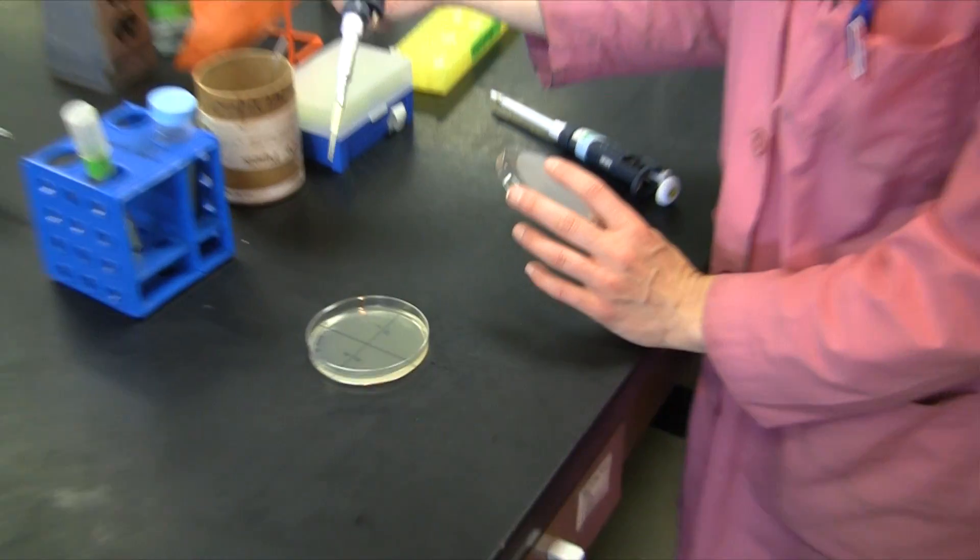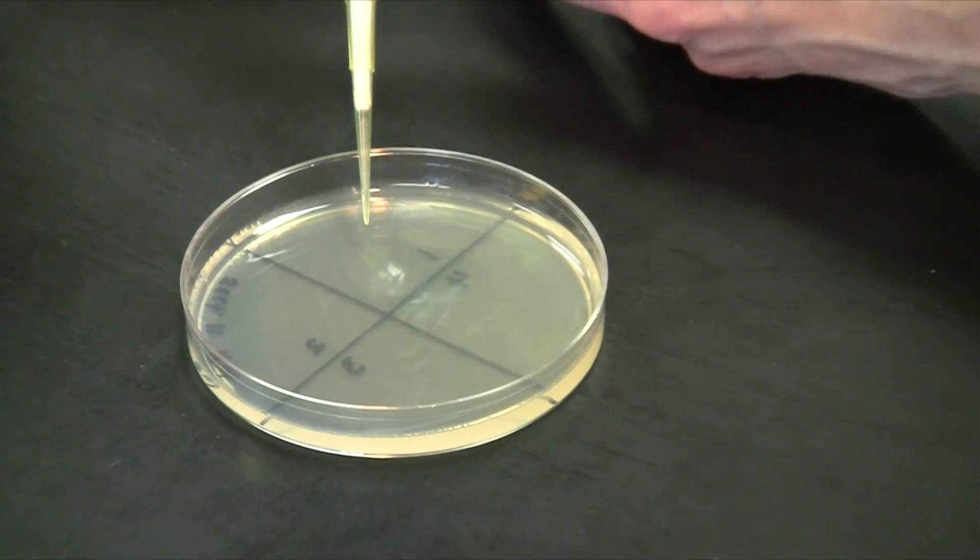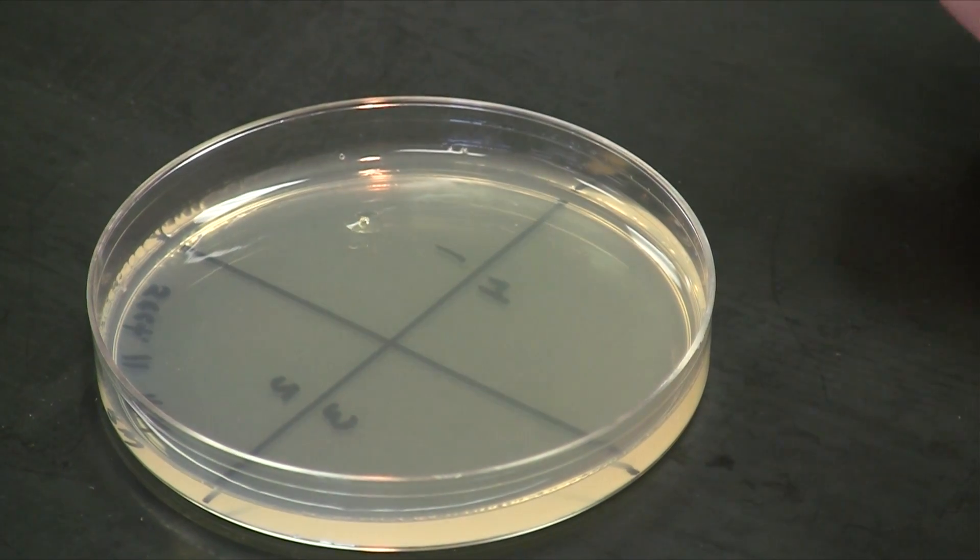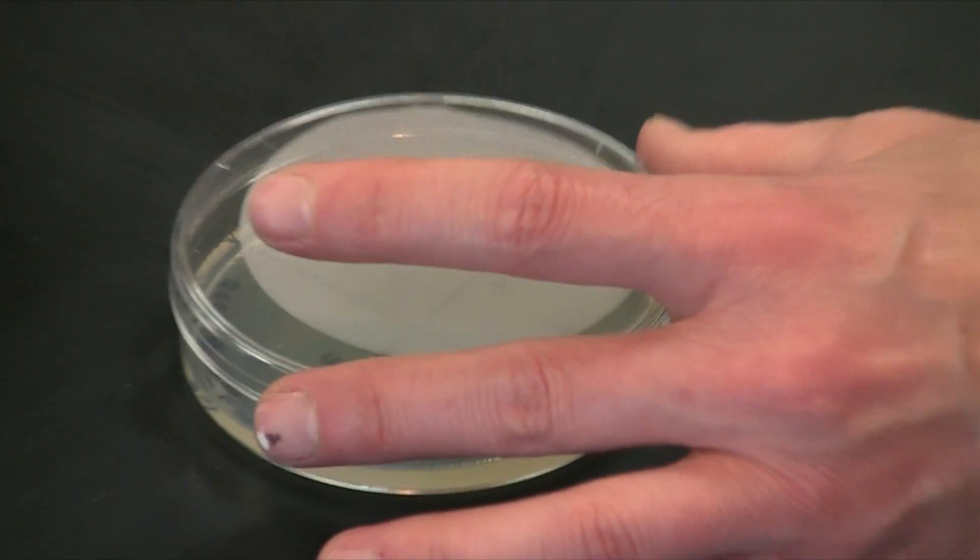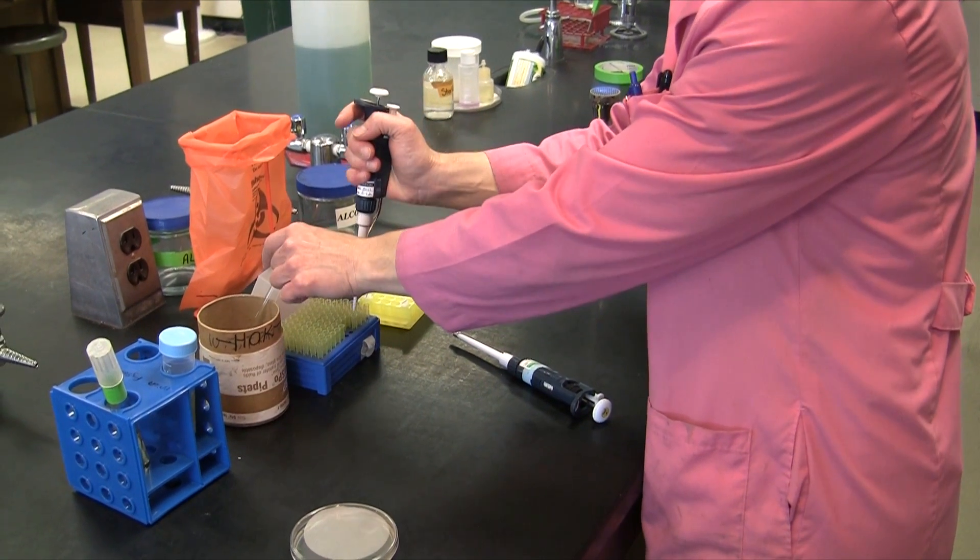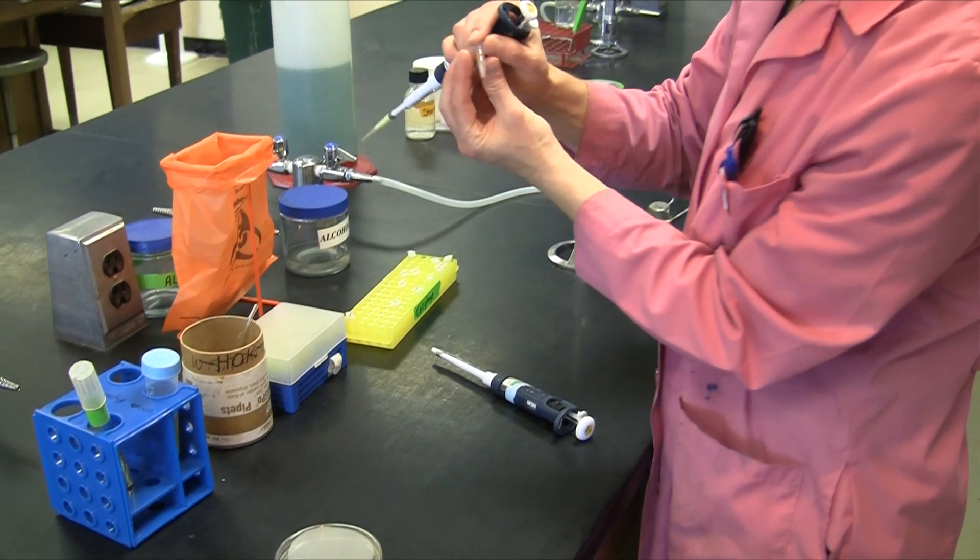We'll spot 5 microliters onto each one of three quadrants. We'll allow the liquid to absorb into the TSA plate, and we know that those are the regions where the viruses will attack the bacteria, leaving a region of lysis in the lawn of bacterial growth.